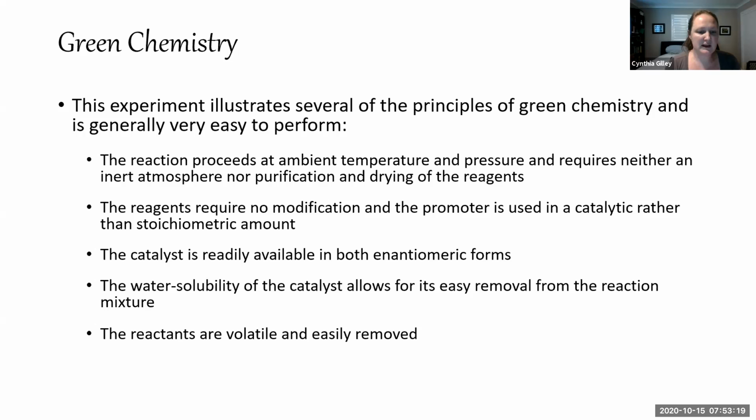And the water solubility of the catalyst allows for its easy removal from the reaction mixture. The fact that L-proline is soluble in water is because it can form a zwitterionic form, which means it has a negative and a positive charge in its structure. We can easily wash it away from the reactants, and we don't have to do any further purification, which is fantastic. And both of the reactants are volatile. Acetone and isobutyraldehyde both have a low boiling point, so they're easily removed, which again means that we don't have to do any extensive purification to get the pure product.